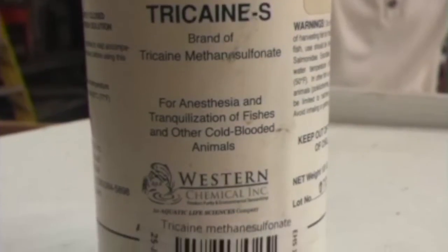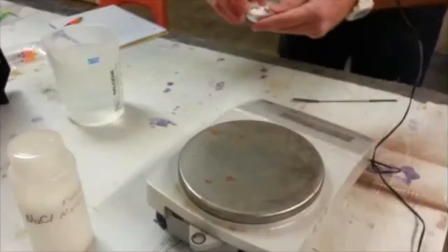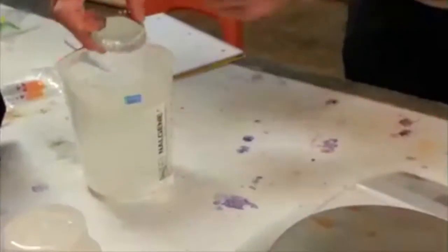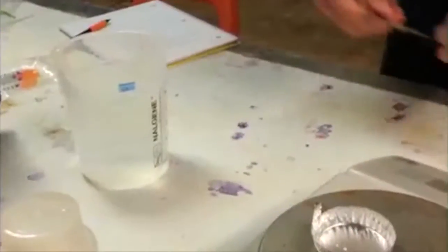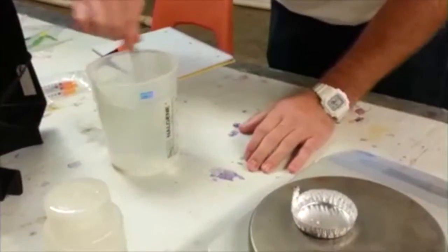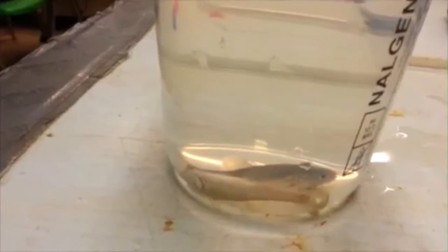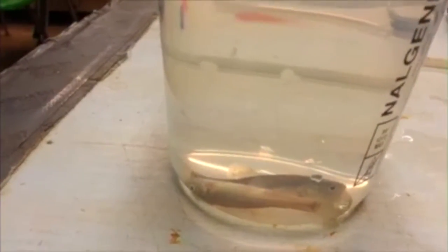A solution of MS-222 is created at 25 milligrams per liter to properly sedate the fish. After approximately 30 seconds of exposure, the fish are fully sedated and ready for VIE application.